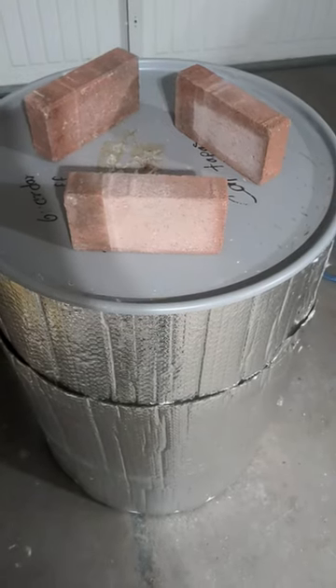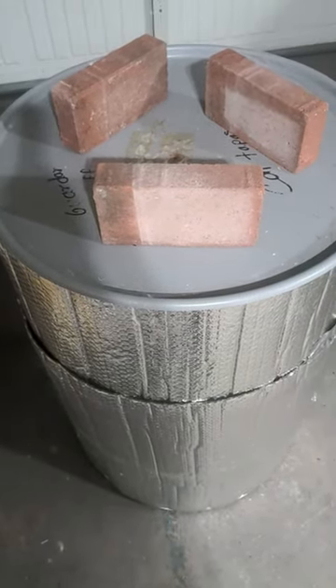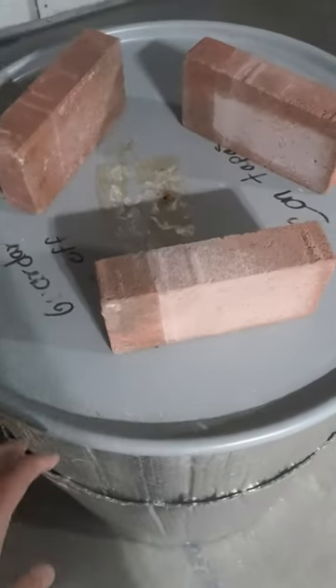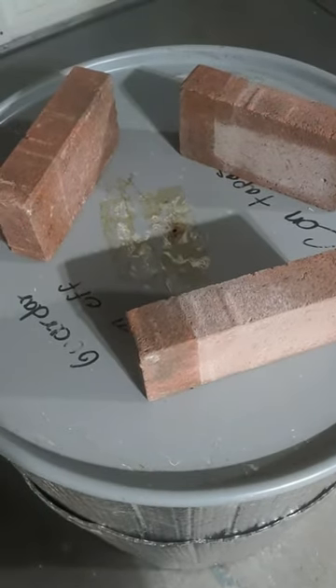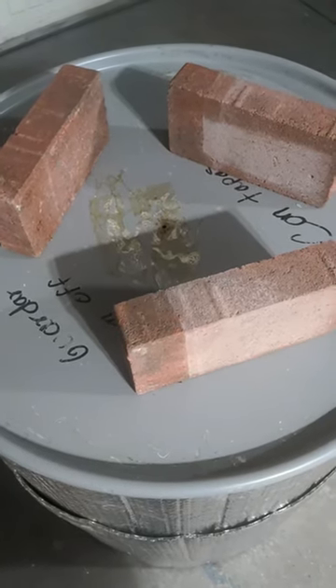At this point just plug it in and leave it for 24 hours. It takes about three or four hours to get the steam going, and then about 12 hours in the substrate's getting near temperature. 24 hours total seems to be working good for me, so that's what I'm doing.